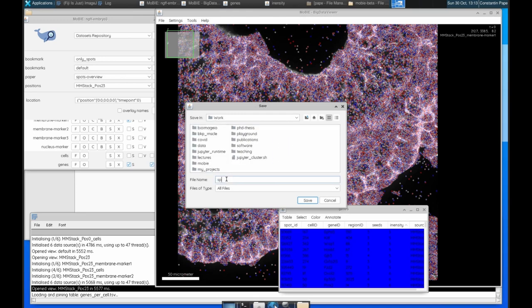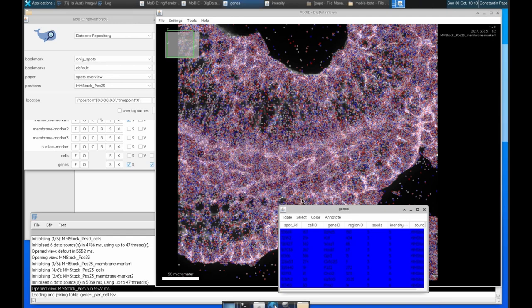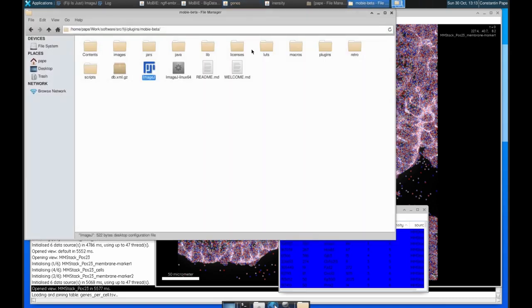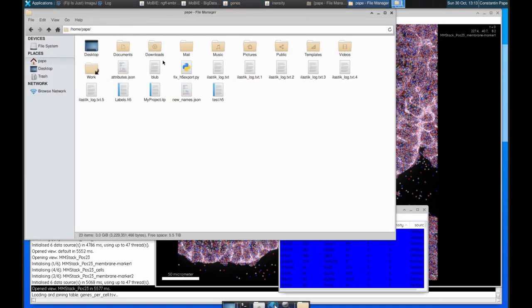And we give it a name, ending with TSV because this is going to be a tab separated values file as before. And we save it, and that will produce that table and put it on your file system.